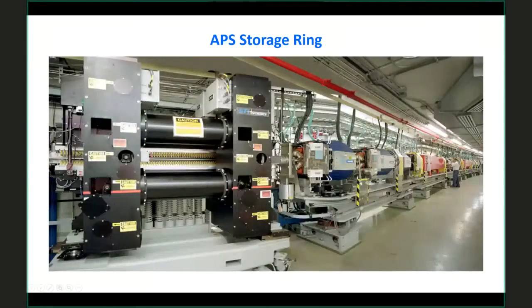So this is what the storage ring of the APS looks like. It's basically a 1.1 kilometer close packed array of magnets. The red magnets here are the dipole magnets, or those bending magnets that I talked about. These blue magnets here are focusing magnets to keep the electron beam as small as we can keep it. And this is one of those undulators. It's a massive structure because there's a very strong magnetic force acting on these poles as you open and close it. And we need to open and close the gap with micron precision. So this is that periodic array.